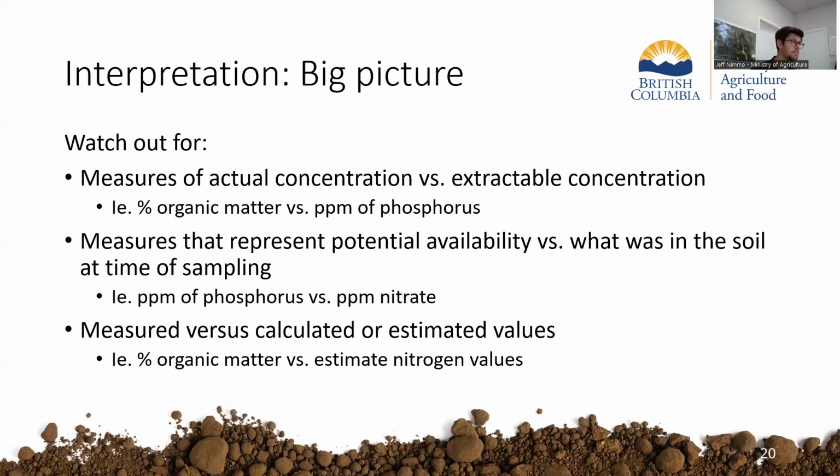And then something like nitrate, where really most of the nitrate that you see on the test result is just floating around in soil water at the time of sample.